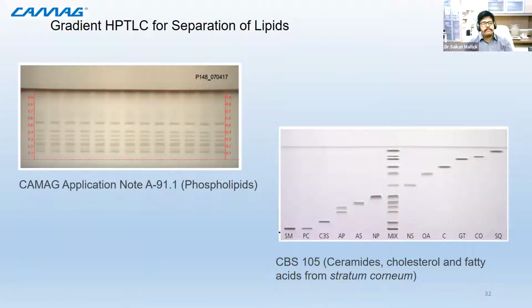These are some examples of phospholipids. And from skin, they have quantified ceramides, cholesterol and fatty acids after an experiment with an ointment was done. The company claim was that it was an antioxidant cream that stabilizes, so with the antioxidant it will not deviate, and that is why you will get a similar kind of response.